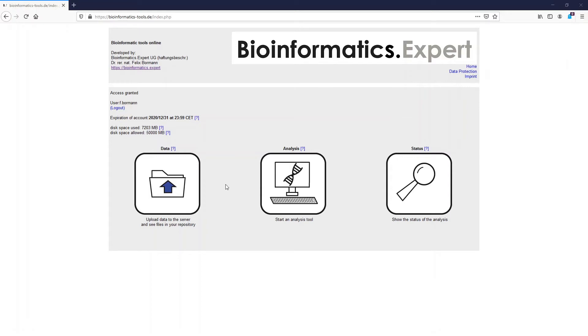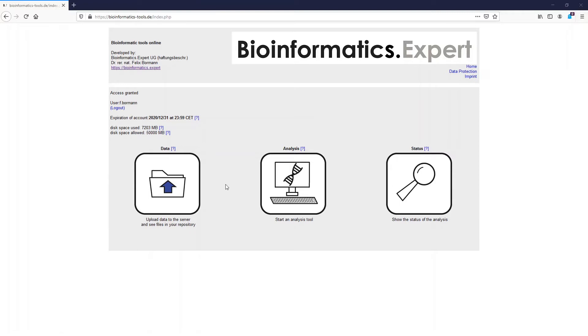Welcome to Bioinformatics Expert. In this video I want to show you how you can do a StringTie analysis. StringTie is a program with which you can identify new isoforms from RNA sequencing datasets, but you can also use it to quantify your results by calculating the TPM or FPKM values.